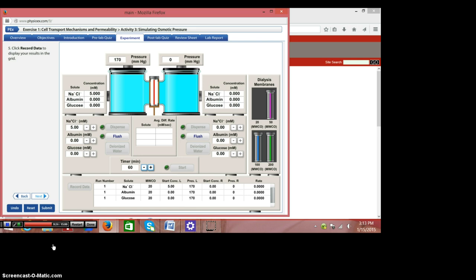Okay, and then you've got glucose with a value of 8. So again, I wrote those right next to that solute, just so I knew what that starting concentration was, since some of them they had you doing a couple different ones. And then I just filled in the information onto the table. So hopefully that makes a little more sense.